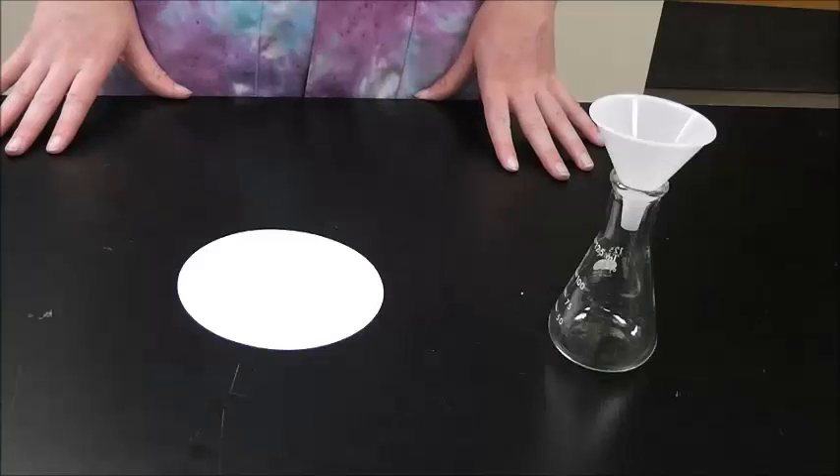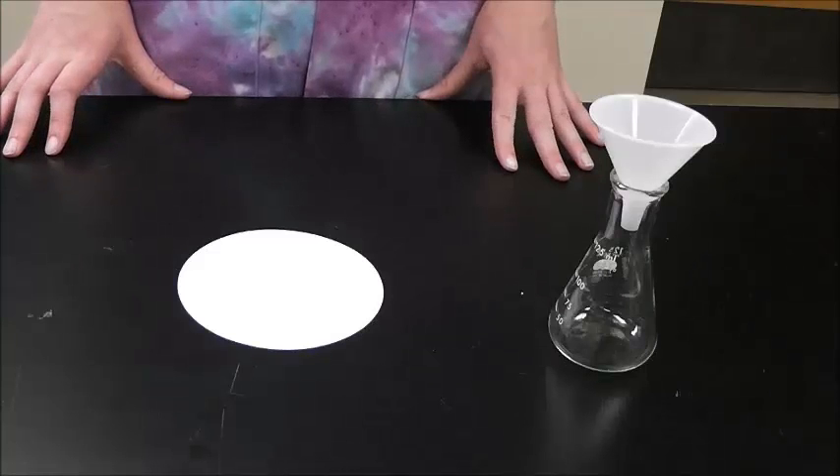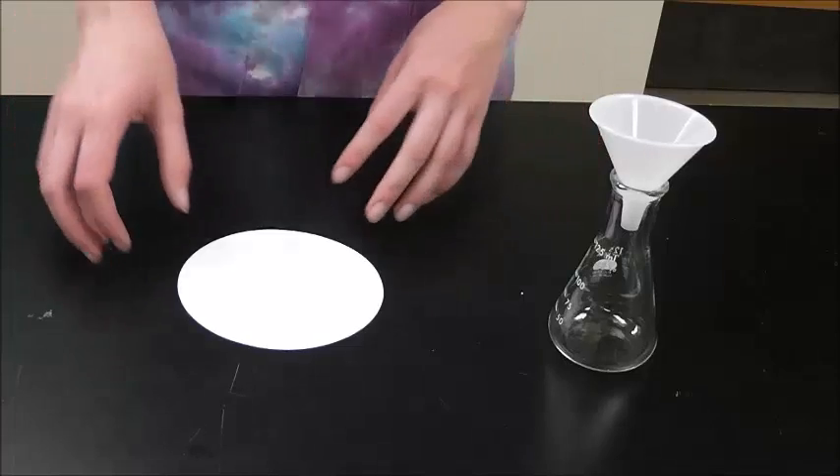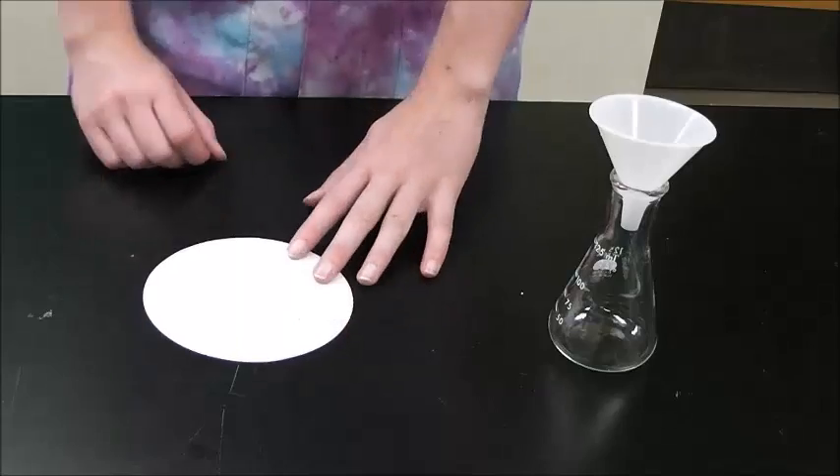Hello everyone, today I'm going to show you how to properly fold a filter paper. This is the kind of filter paper we use for gravity filtration, which is when we extract impurities or other solids from a liquid.